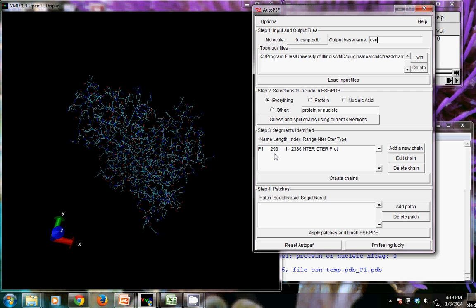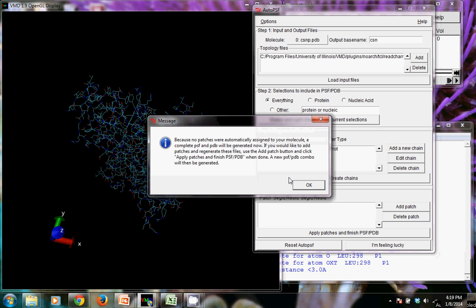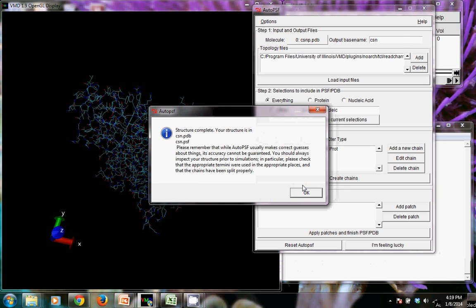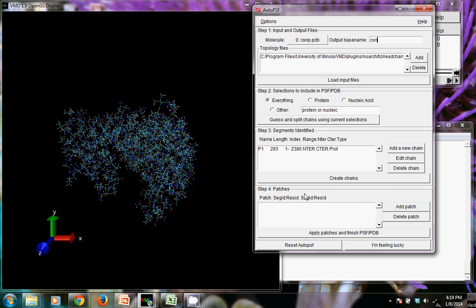And the next thing that we want to do is create the chains. And it's going to give us this output. As long as you don't have any other things that you need to take care of, special patches to deal with things like phosphorylation, then we can just click OK because we don't have anything. We're doing this in the most basic way we possibly can. And it will give us something that says the structure is complete. We can click OK.